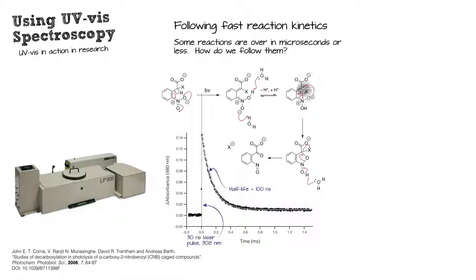And the next step is going to be then a subsequent intramolecular ring closing here to create this compound here, which then does another fast proton transfer and an elimination to give you the product. So what we're following is the absorbance as it fades away as we go from this more extended pi system to this more compact one, and there's our product.